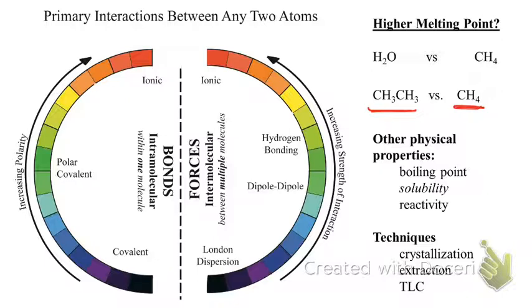We're going to look at solubility today. As far as the techniques, we already looked at melting point. We won't have to worry about boiling point, thankfully. We're going to do crystallization this week. I believe next week is extraction. We'll also do TLC in several weeks after that. All of them go back to understanding these same intermolecular forces and the bonds that they come from. So you need to be able to interpret this.